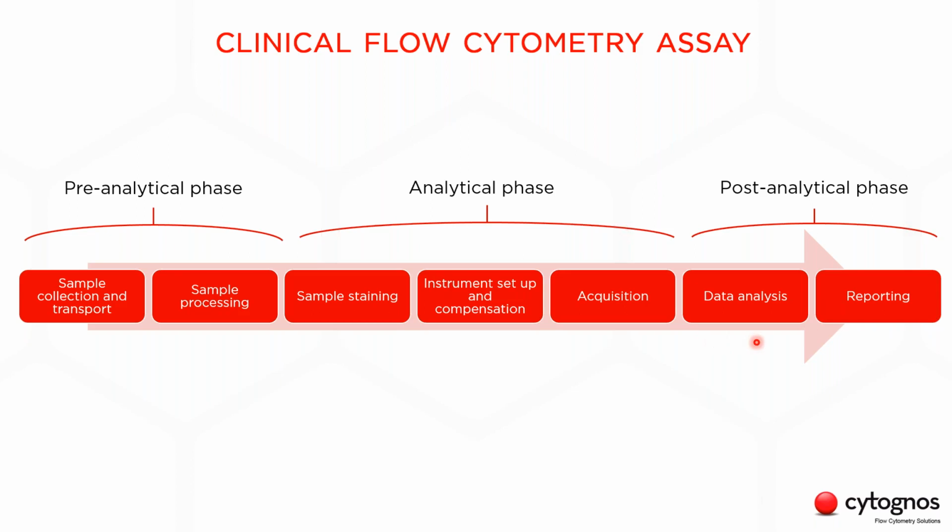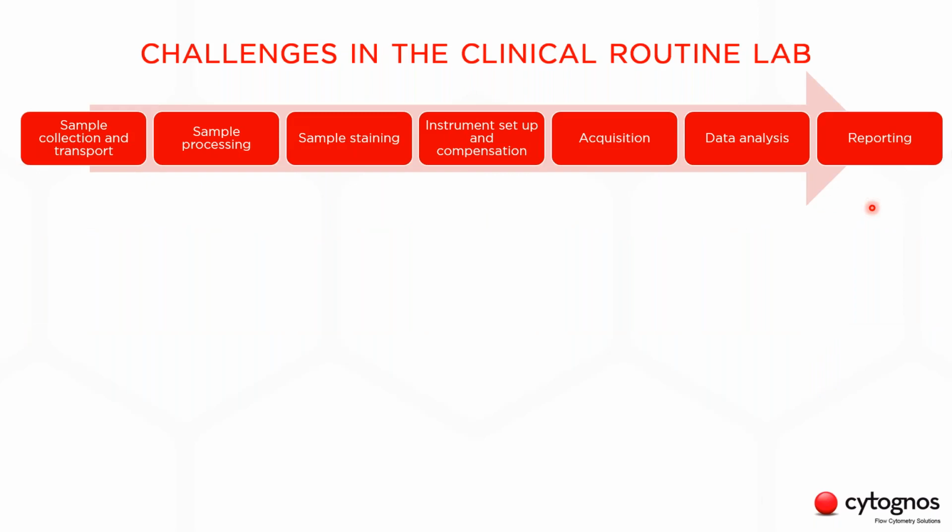There are multiple checkpoints here where different errors may be introduced and ignored, especially in the pre-analytical and post-analytical phase. And these errors have economical consequences, but more important, negative effects in the patient care. That's why all flow cytometry assays require careful assay design, instrument setup, performance validation, and ongoing quality monitoring. Okay, so now we are going to see the most common issues we face in clinical routine briefly, and then finally how we can overcome them.